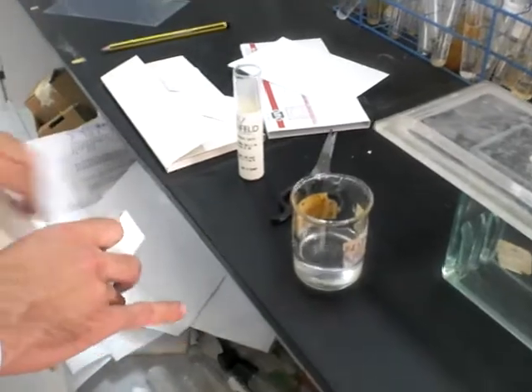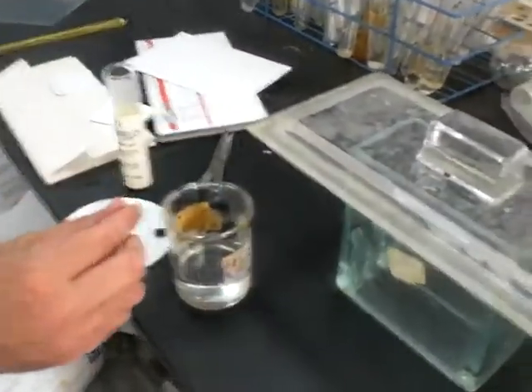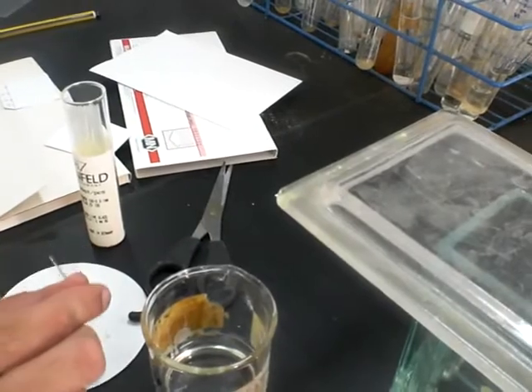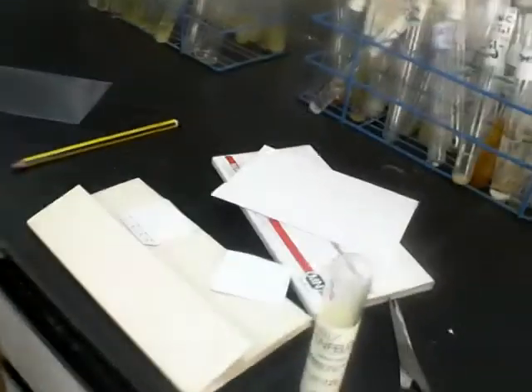We can wash the capillary by just immersing it in pure solvent, then over a filter paper we drain the traces of the previous reactant or the product, we don't know yet.